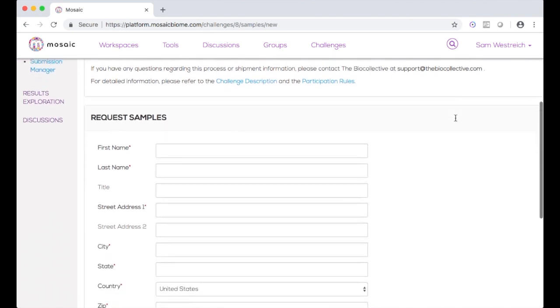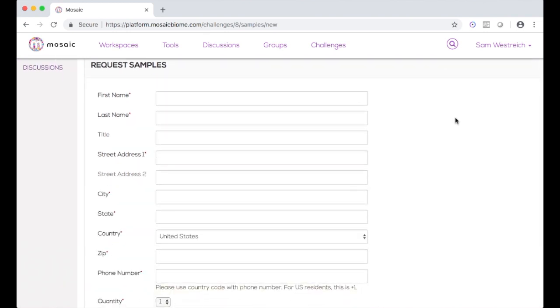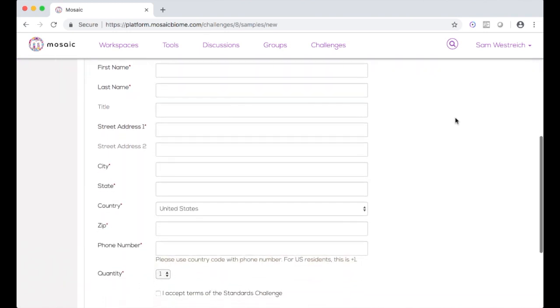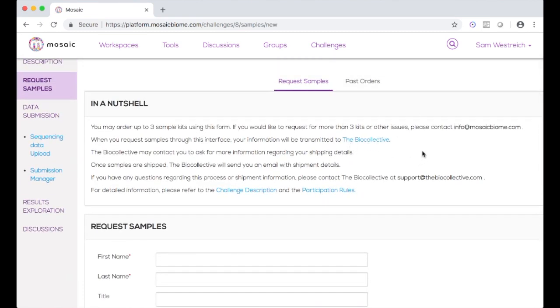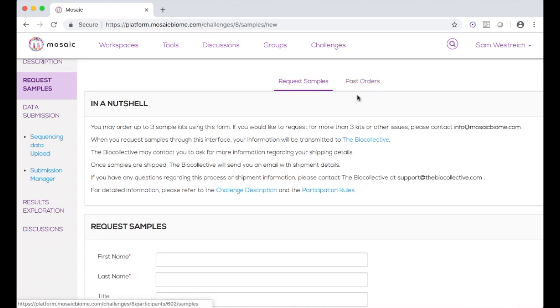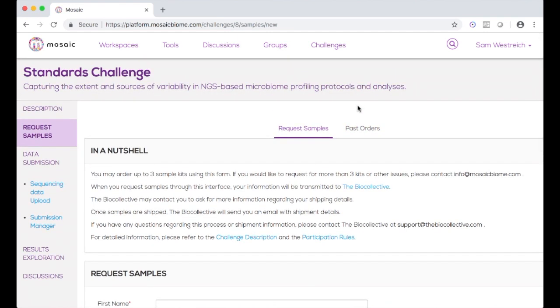Once you have placed the order, filling in your first and last name, the address where you want the samples shipped, and other information, a sample kit will be sent out by the BioCollective. We can ship these kits anywhere in the world, and they will arrive free of charge. After you have placed your orders, you can use this Past Orders tab in order to view your orders and see their status.